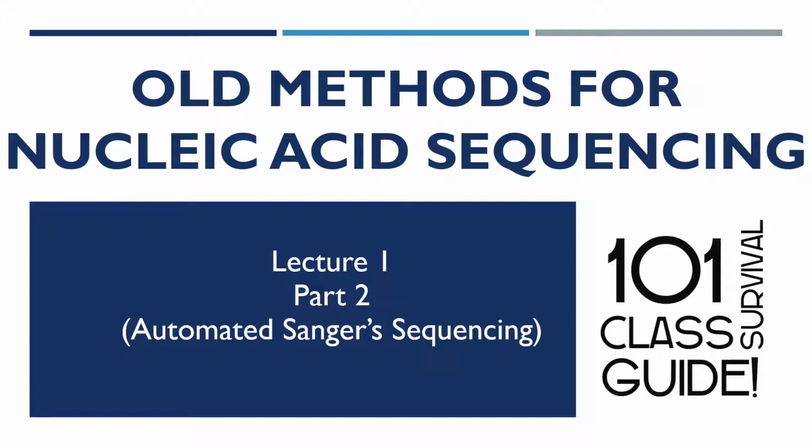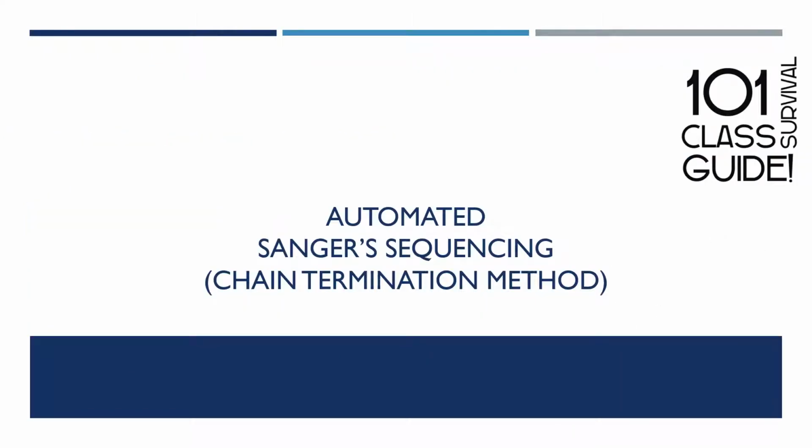This is part 2, in which we will be discussing the automated Sanger sequencing method. The automation and sample preparation for the Sanger sequencing method was performed by Fred Sanger in 1977. It utilizes the chain termination method of the previous Sanger sequencing method and an automated form of detection.